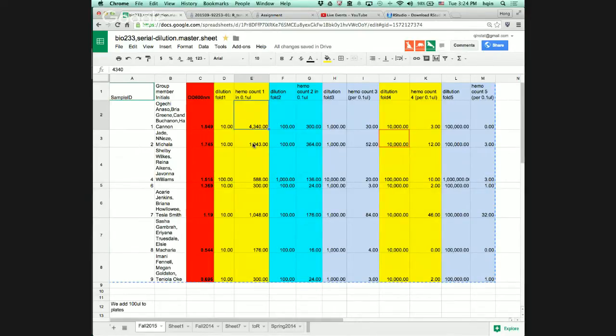Basically your number of count in that 4x4 grid, divided by 0.1 microliter, that's your concentration of numbers per microliter. And then this is your raw data, and this one you times the dilution ratio. That goes back to the original concentration. That's basically what the code is trying to do.